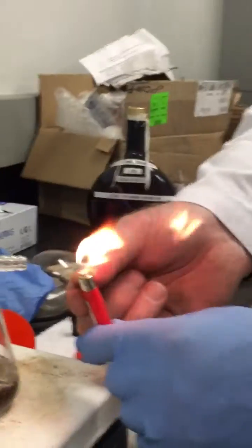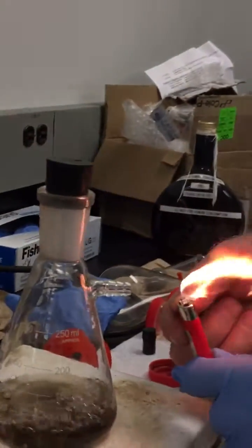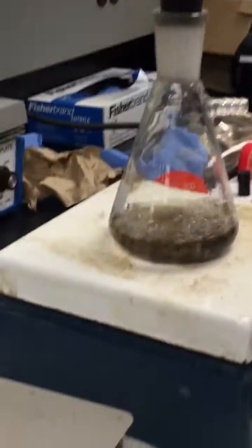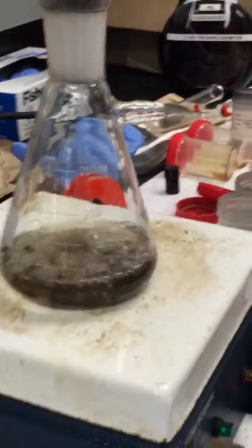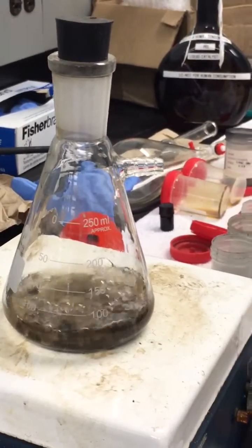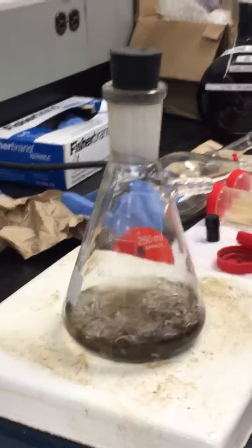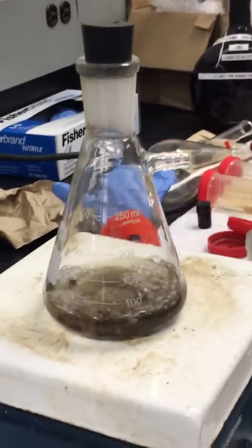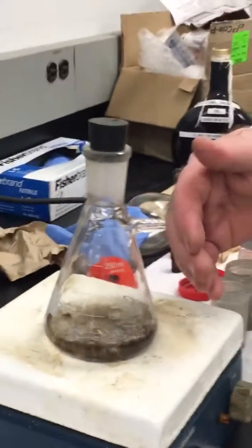You'll notice initially there's some soot coming off, which is because we haven't processed the gas. I'm just turning down the temperature slightly, because it does not require a lot of heat to allow it to off-gas. You can actually feel the jet of gas coming out.